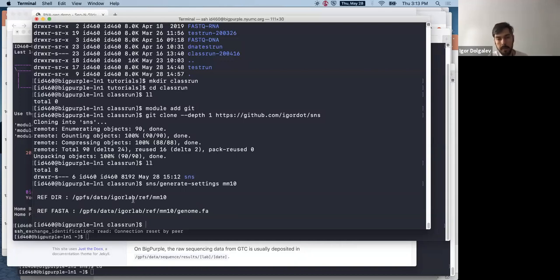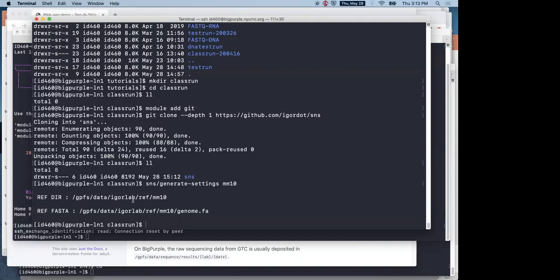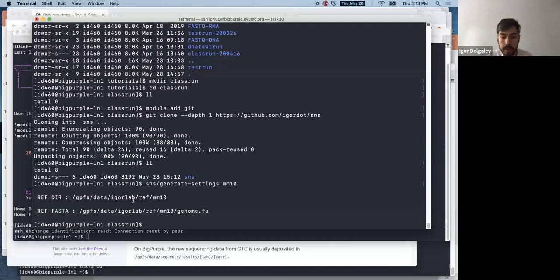And so as I mentioned last presentation, there are the tools that you're using, but besides the tools, another consideration is your reference files. Although there are many tools that are well described, once you try to figure out which reference files you want to use, you run into all kinds of issues.